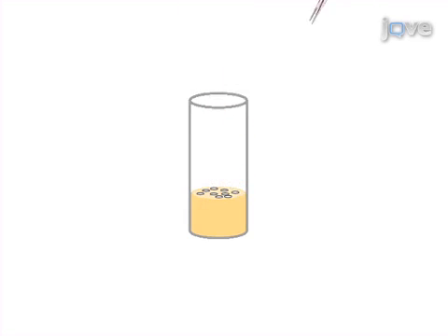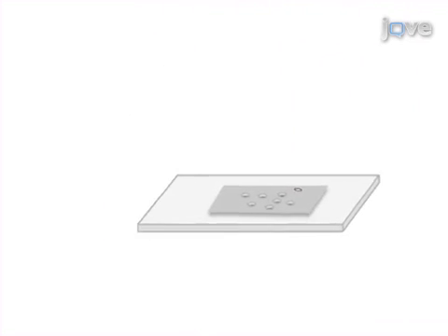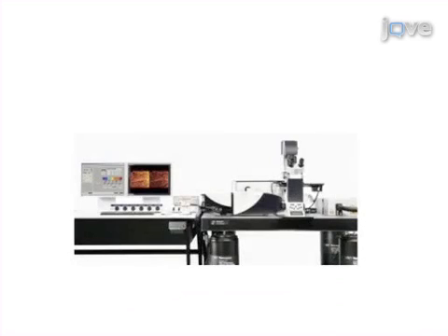Next, transfer the embryos onto a slide and then manually remove the chorions from the embryos. Dechorionated embryos are subsequently mounted in an organised fashion onto previously prepared slides, and, depending on the experiment, may be micro-injected with appropriate spindle checkpoint-inducing reagents. The final step in this procedure is to perform time-lapse imaging of embryos using confocal microscopy.